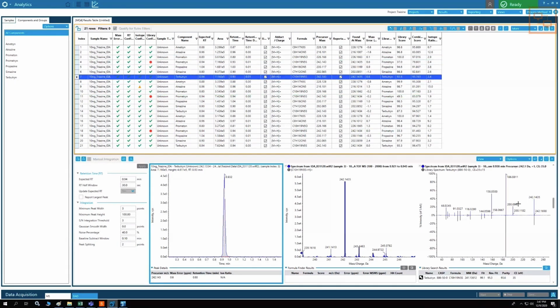Right, this is the terbutryn data. What do you see different here than we saw in the prometryn? Focus on that 186. And also take a look at the purity. Purity is also not great, right? So the 186 is coming from terbutryn.